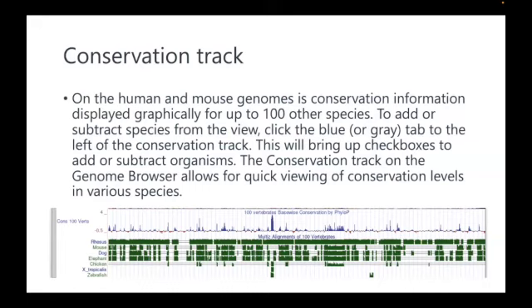And I wanted to ask what kind of sequencing do you do to diagnose it? Is it RNA-seq or do you do whole genome sequencing? Whole genome DNA sequencing. RNA-seq just checks the expressed genes. Even though you can call the variants, it's only for expressed genes. So non-expressed genes are not even called.